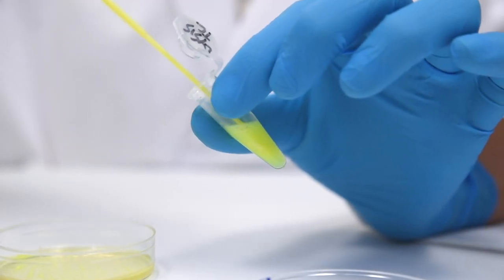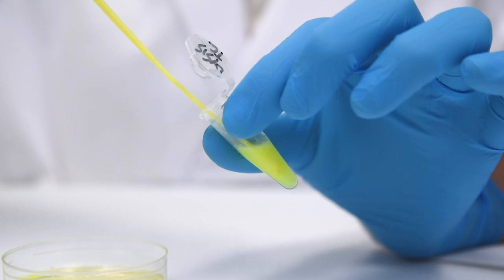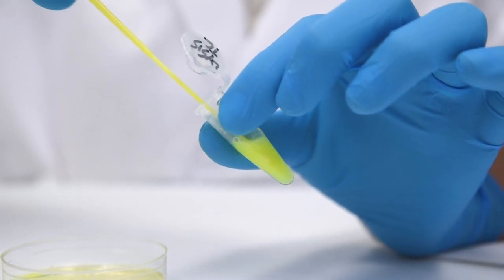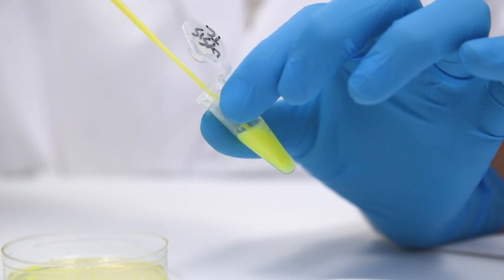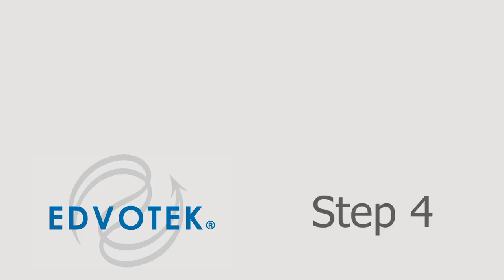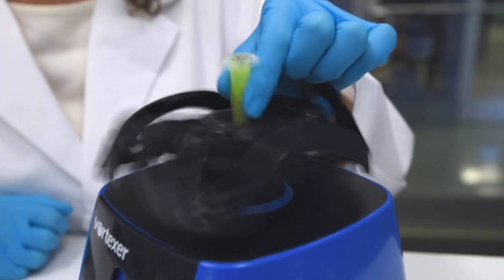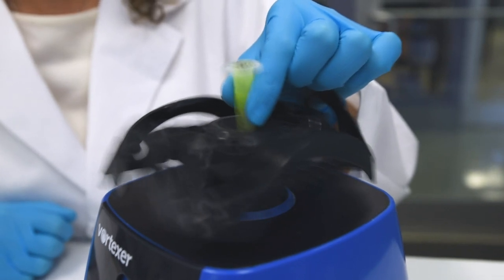Step 3: Twirl the loop containing the green colonies into the tube containing the lysis buffer. Twirl vigorously until the cells are dislodged into the buffer.